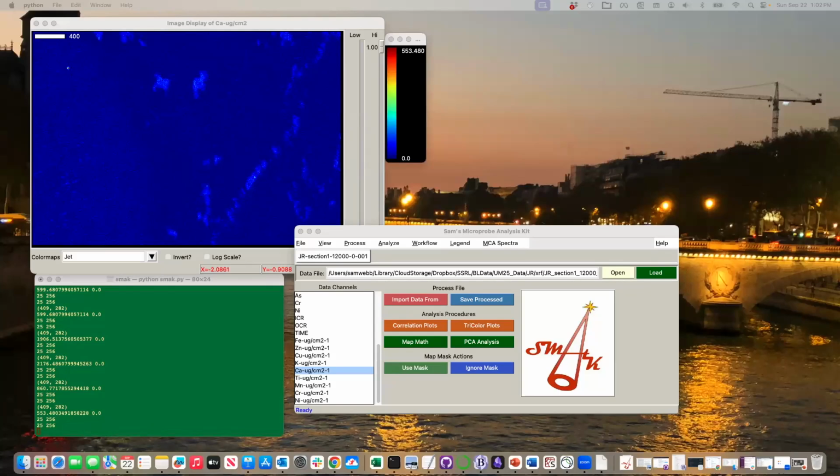Okay, so we have taken some data, we've made some concentrations, looked at some cool viewing. Probably the last thing we should do with this data set here will be to look at the raw XRF data and go through how we would fit that with PyMCA to actually do our fitting properly.